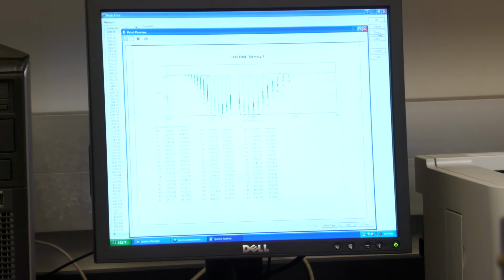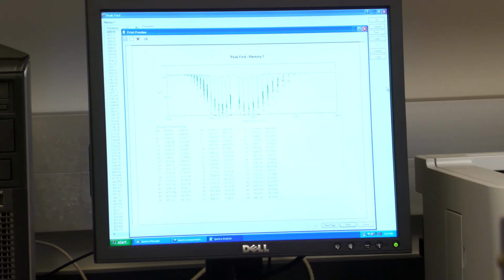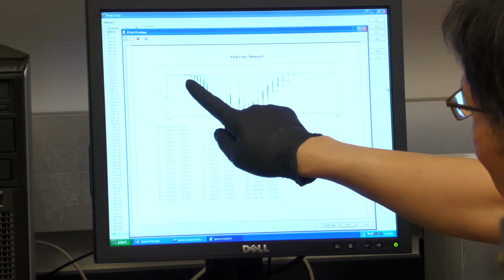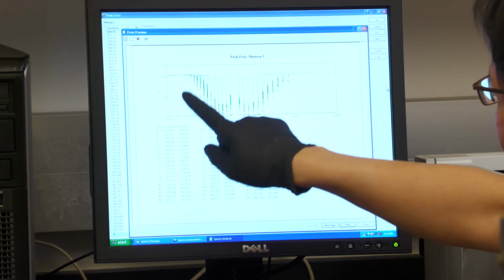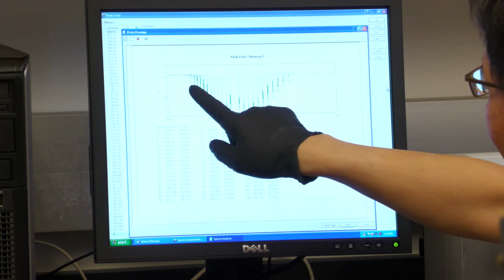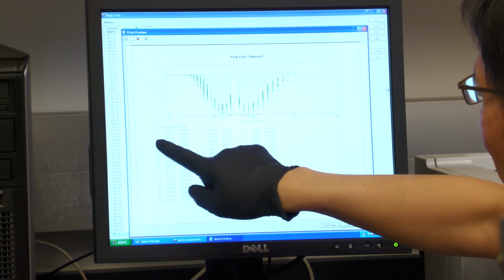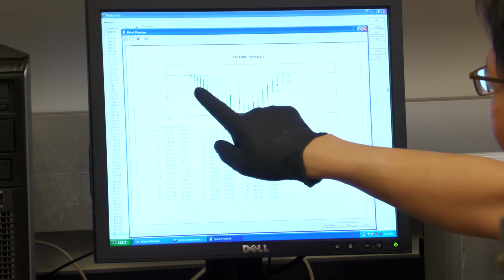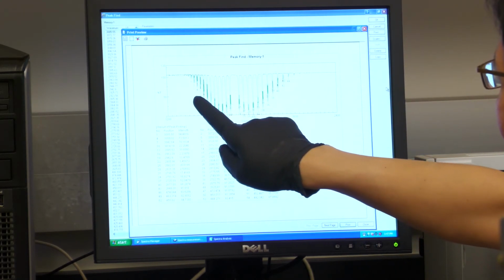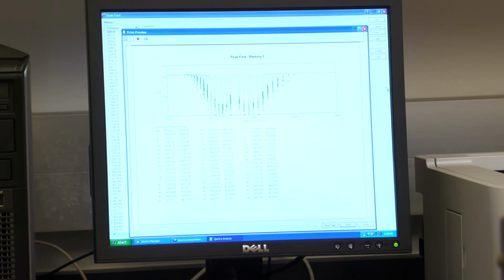When you click the print, now very good. You click the print, then mark this peak, okay? Then mark the peak 1 corresponding position, that means frequency here. Peak 2 is a high peak, okay? So you're starting from peak 2. See, peak 2 is also a higher peak. So peak 2 corresponding frequency here. You can see peak 2, 4, 6, 8, 10, all the even numbers correspond to high peaks, okay? So be careful, the first one, you forget this one.